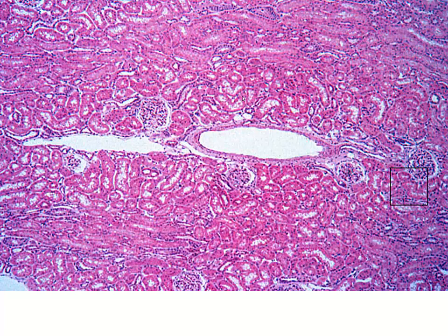Once again, we are looking in the cortex. We can see our renal corpuscles quite nicely. We can see our interlobular artery, possibly interlobular vein. Can't really tell the thickness of that wall. There's not much thickness there.